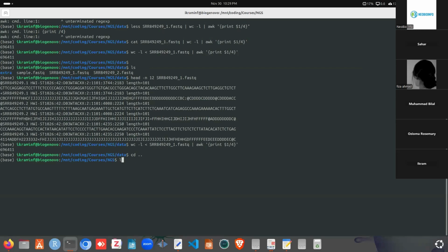Okay, I need to show you what this directory actually contains. I already created a directory QC, and we have the reads in the data folder. We need to pass our output into ./qc. Dot means the current directory, and qc for the QC directory. If the file size is small, then we don't need to specify the thread option. Otherwise, we can use it. And then our file name.